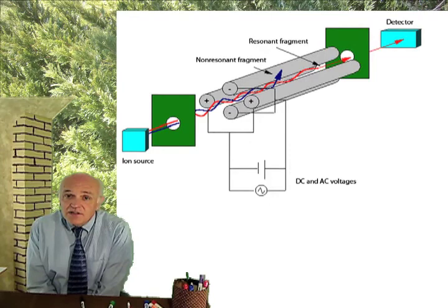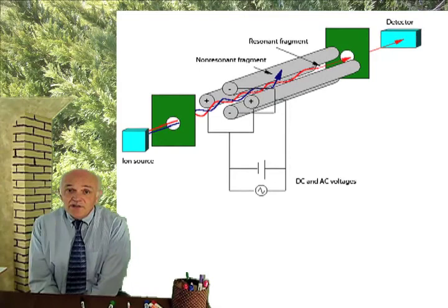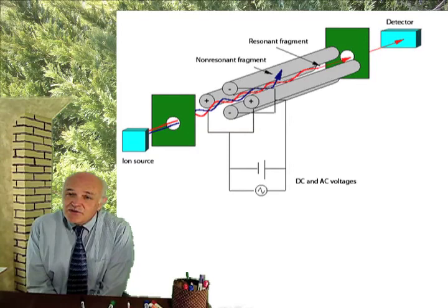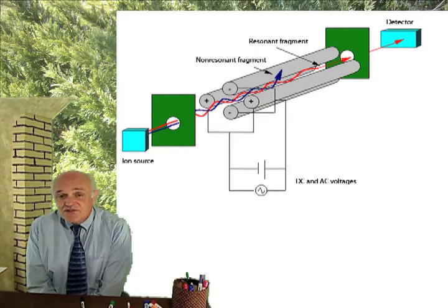That's the first second. Now the second second, same as the first second. Let's start with mass 35, then do 36, and then go all the way to 500. Now we're on the third second. I think the point is clear, that the engineers have it designed so that the mass spec will filter selectively, and it's programmable by the operator, but from about 35 to about 500 is the 8270.